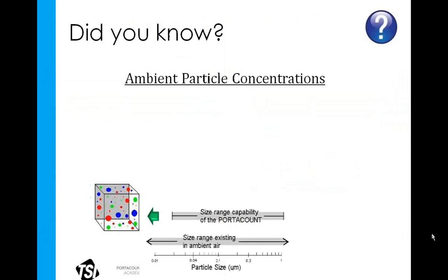I'd like to take a moment to better describe why we see differences in the ambient particle concentrations between the N95 versus the non-N95 operations. On our last slide, we saw the completed daily checks, and the minimum particle check with the N95 was only 179, but without the N95, it was 3,517.